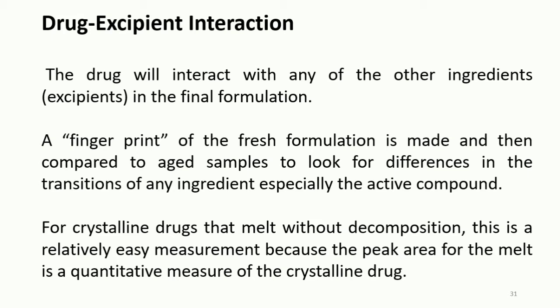Because the dosage form must be stored over a period of time at some temperature and relative humidity, there is a need to confirm that the efficacy of a drug formulation will not change with time. Two ways are used by pharmaceutical companies to improve storage stability, or to keep the sample below the glass transition of any ingredient.